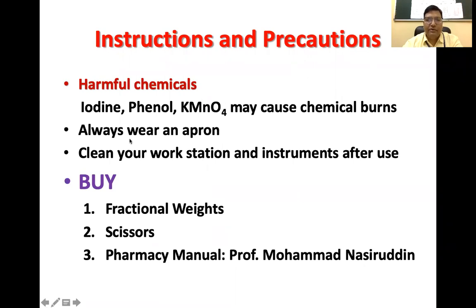When you are in the lab, you should always wear an apron and you should clean your workstation as well as instruments after use. What you all are supposed to have when you are coming to this lab is a fractional weight box, scissors, and a pharmacy manual which has been written by Professor Mohammad Nasruddin sir. So these are the three things which you are supposed to have with you when you are coming to this pharmacy lab.